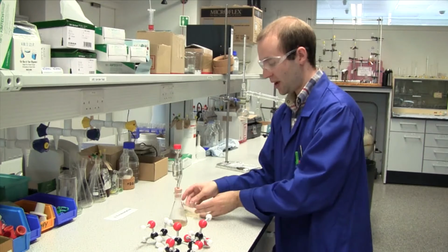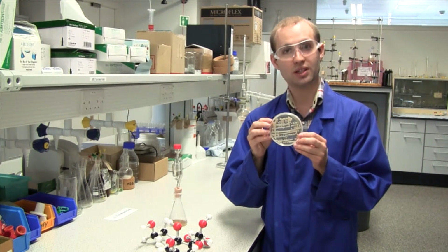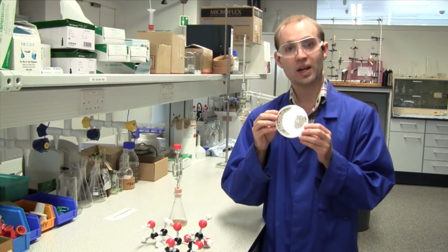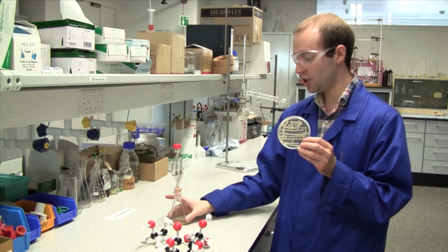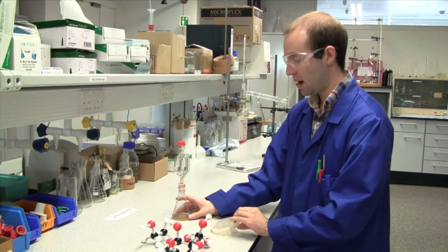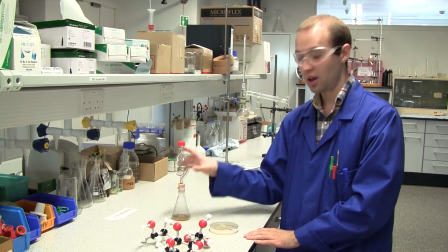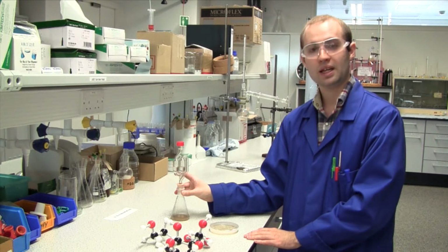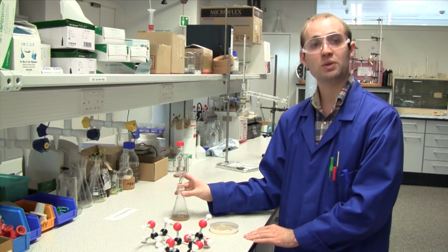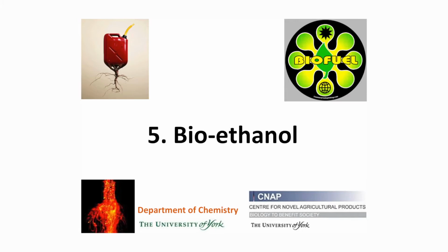First of all, we have to grow the yeast on agar plates to produce yeast colonies. From these colonies, we can add these to the fermentation vessel and add our biomass. Then, bioethanol is produced and the CO2 is dissolved in the water above. This is done in a sterile environment, so we don't kill the microorganism yeast in the process.